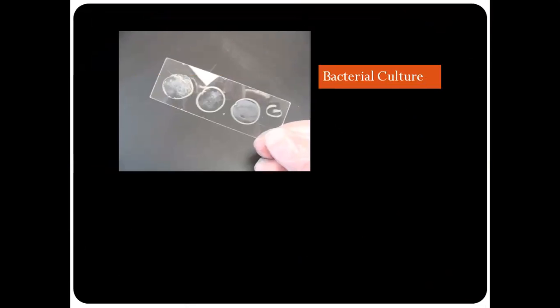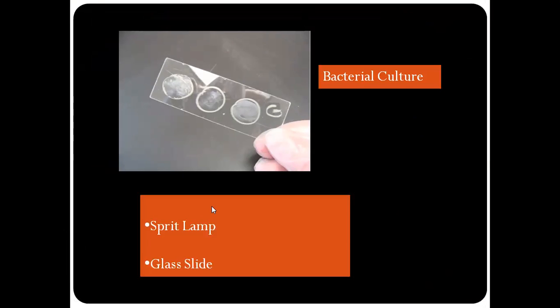Then the bacterial culture, which should be smeared like this one. Then apart from this, you have to take a spirit lamp and a glass slide. So these are all the requirements for the practical.